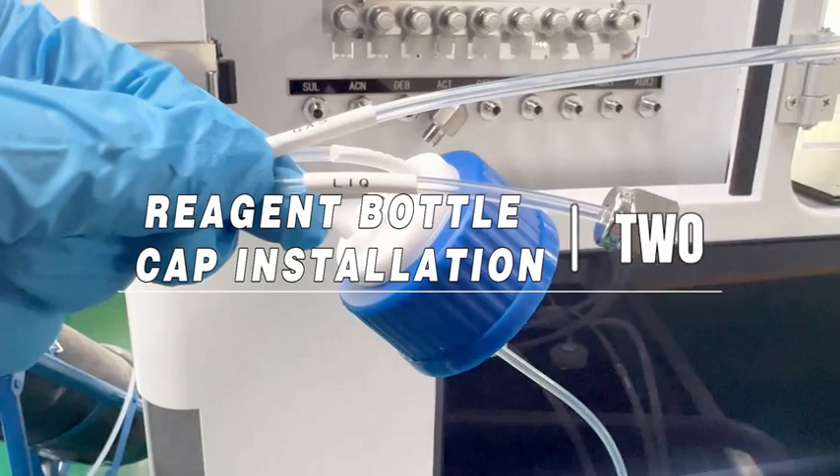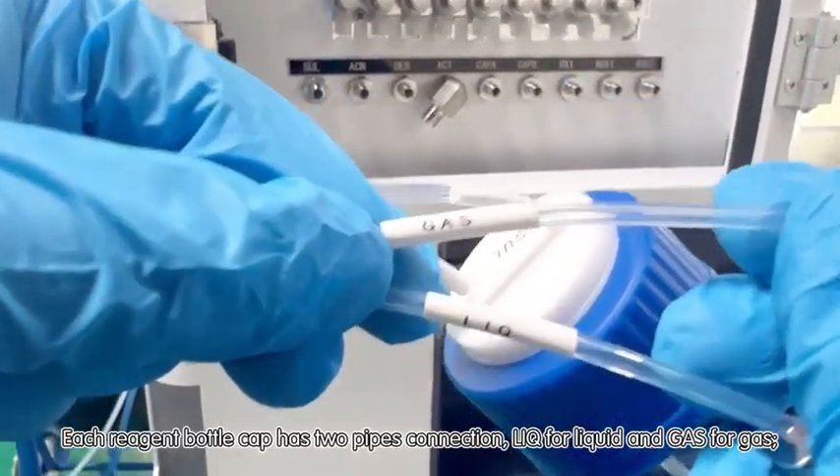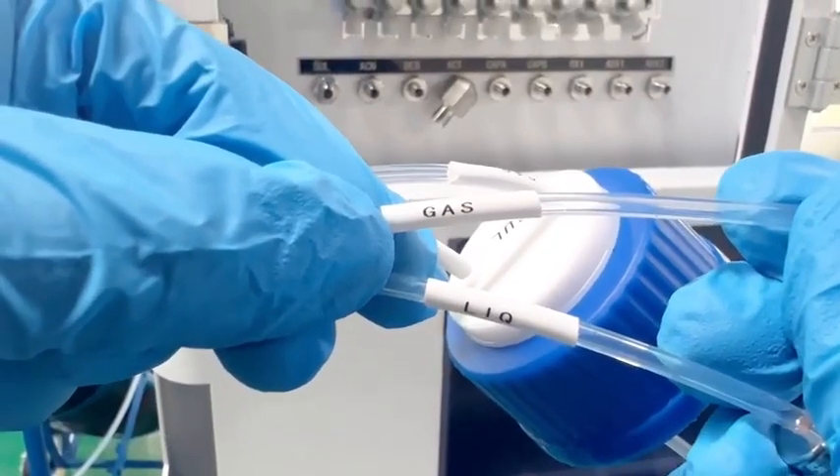Reagent bottle cap installation, step two. Each reagent bottle cap has two pipe connections: liquid for liquid and gas for gas.